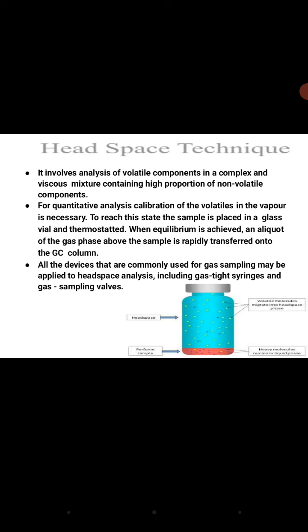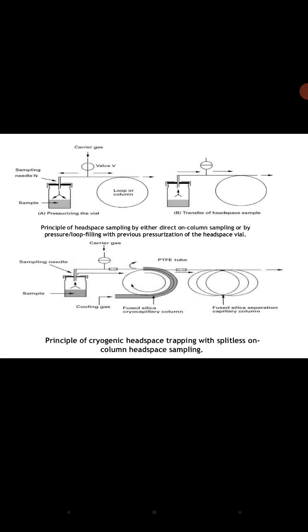All the devices that are commonly used for gas sampling may be applied to the headspace analysis, including gas-tight syringes and gas sampling valves. This is a diagrammatic representation of the headspace technique.